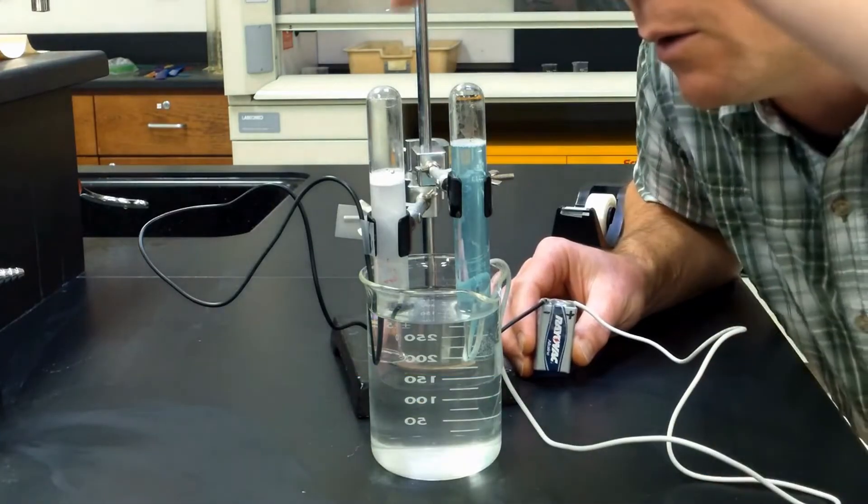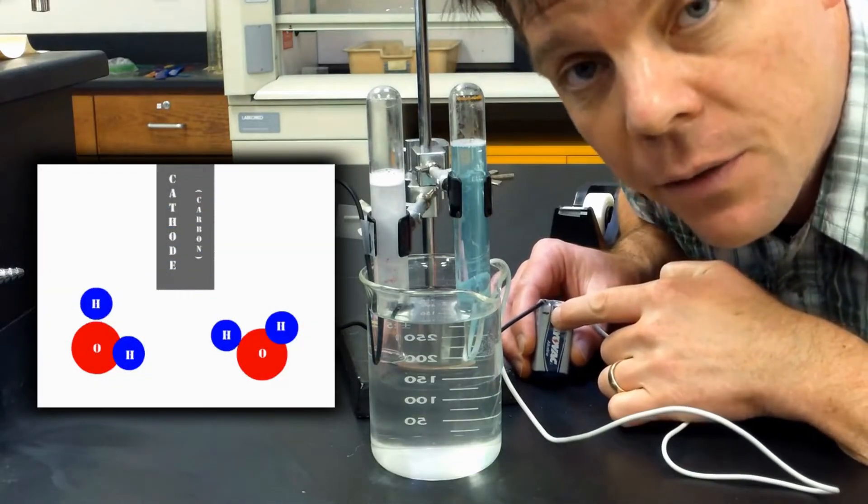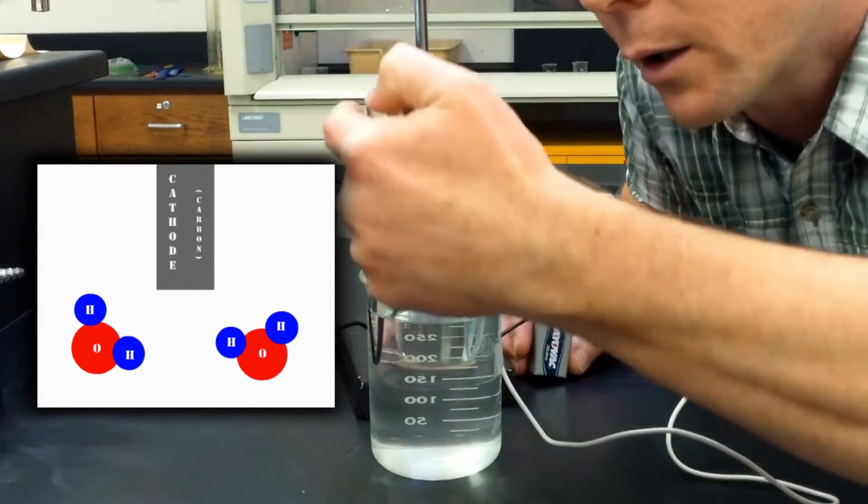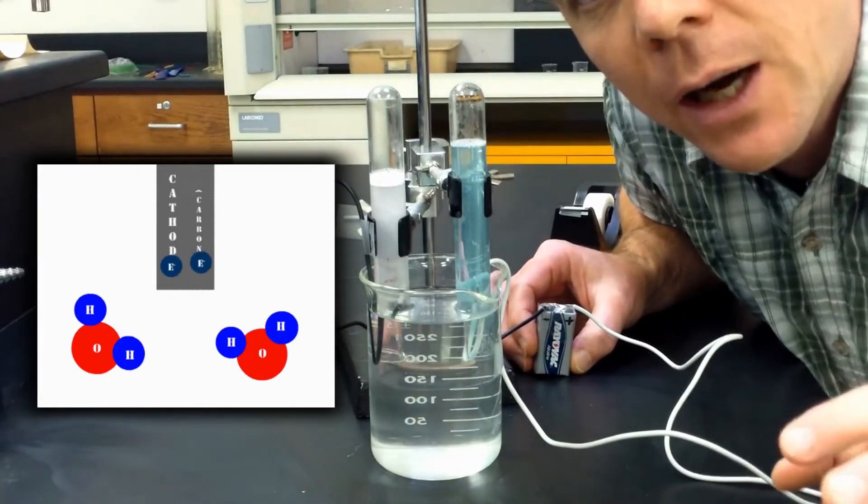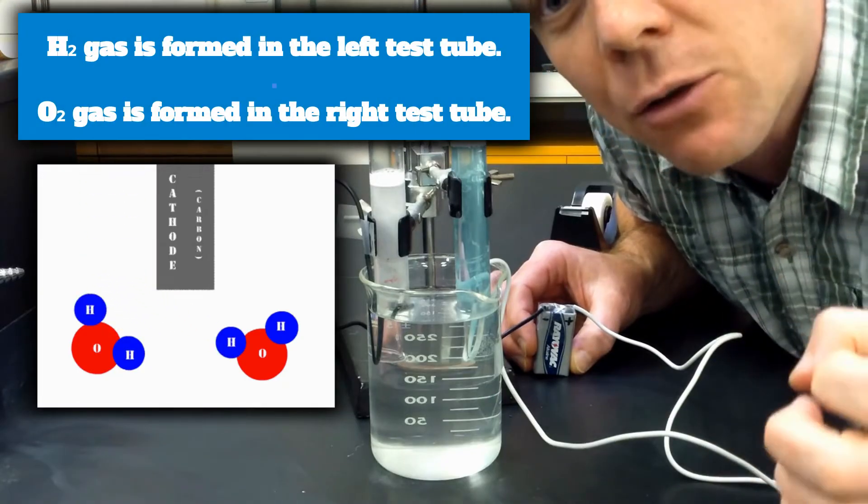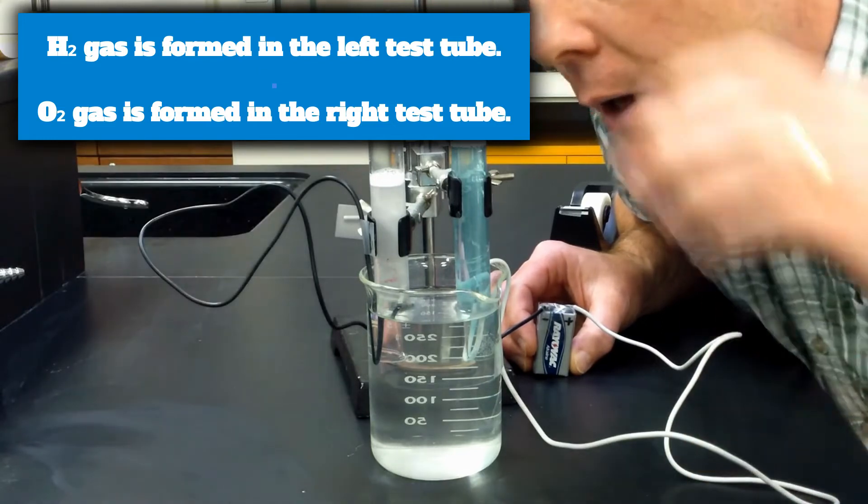The cathode, which is this terminal right here, has been hooked up to the negative side of the battery. So there are electrons that are flowing into the water at this terminal. Those electrons are causing water molecules to be reduced, and this actually forms hydrogen gas and hydroxide ions.